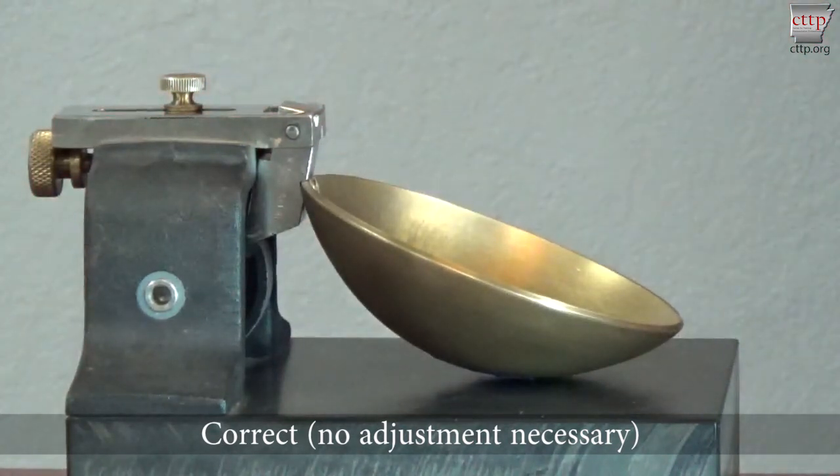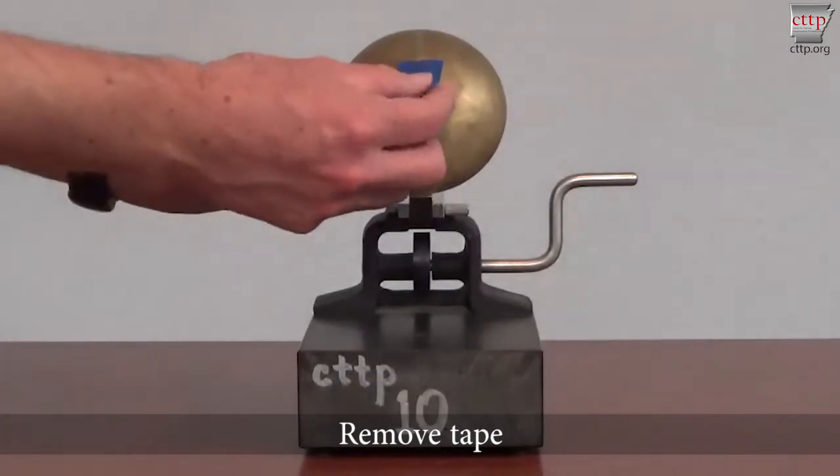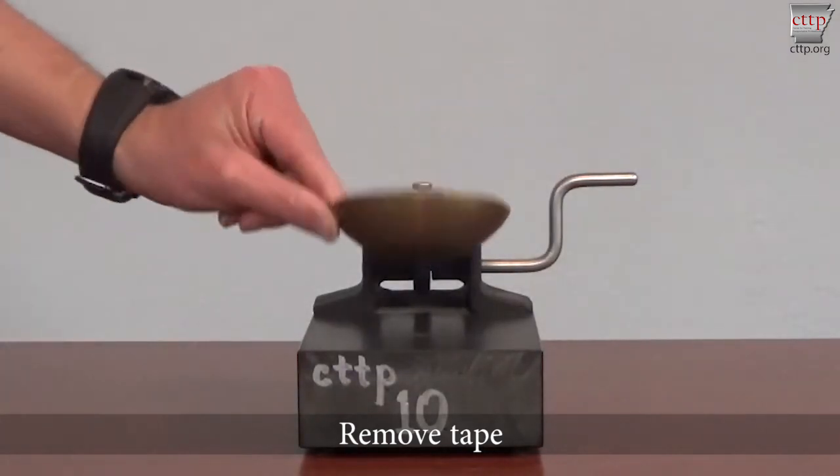A ringing or slight clicking sound may be heard along with slight movement in the cup. The final step is to remove the tape from the bottom of the cup to prevent an error in testing.